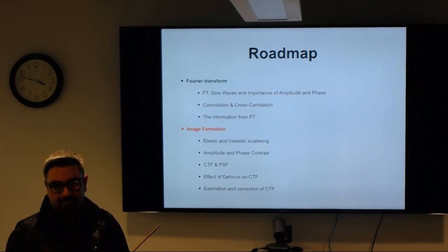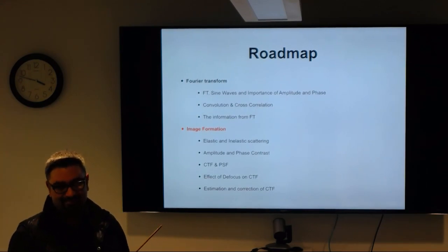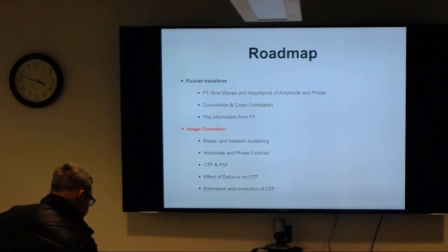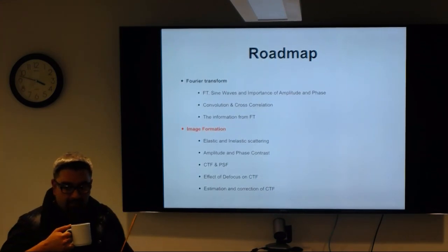There's crystalline, there's amorphous, there are multiple forms of water that have order, and hexagonal ice is very clear. That's very sharp. You see that sharply. But there are other forms of ordered ice. I'm going to point that out because we see that a lot, and you're going to see that quite often, especially when you go to the microscope.